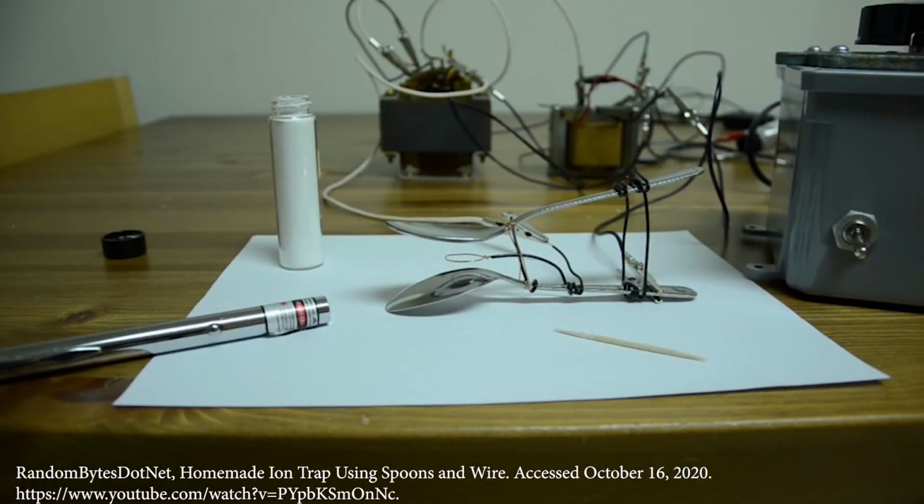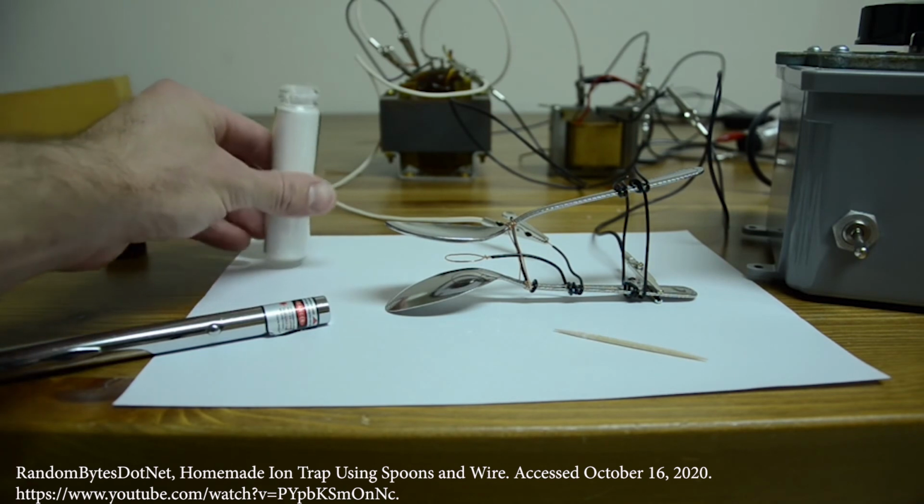Okay, so this is a really cool video this gentleman made where he's going to use two spoons as end caps, and he's got his ring electrode there. It's just a piece of wire.